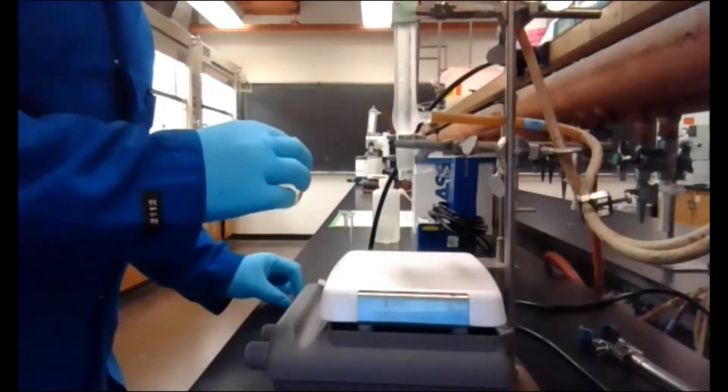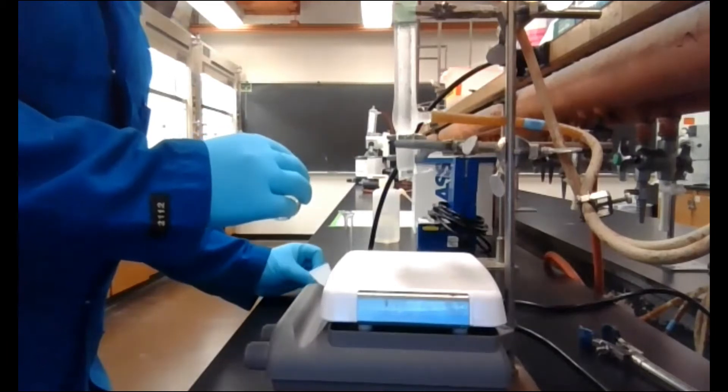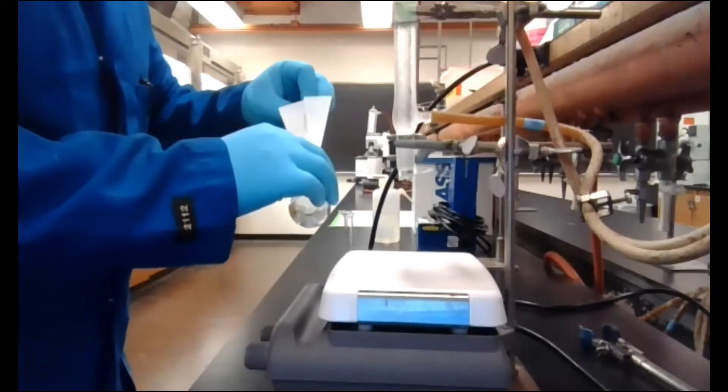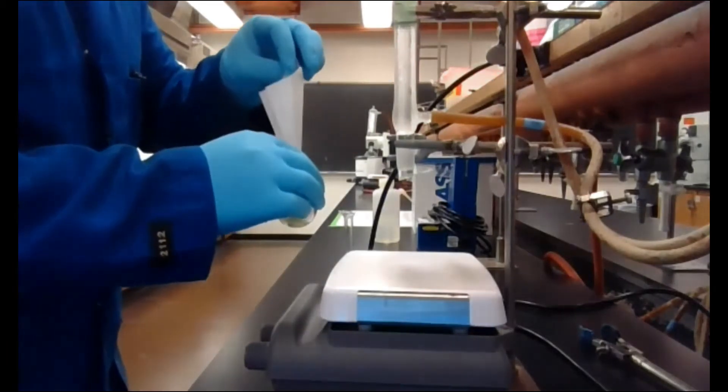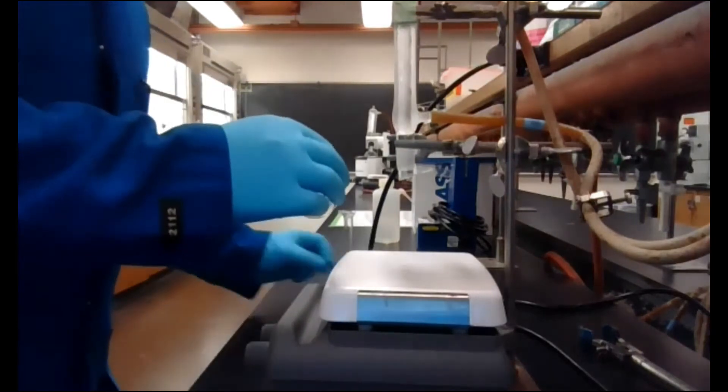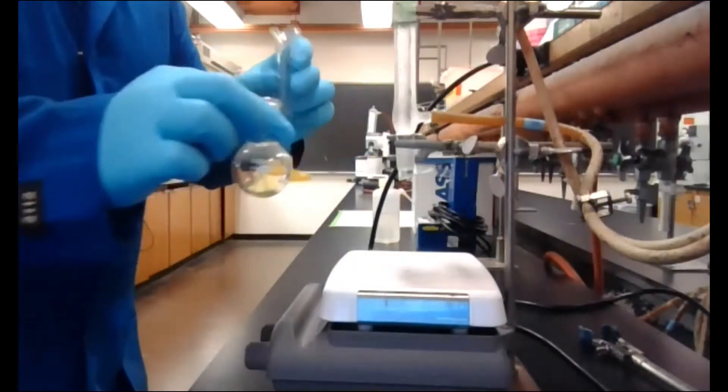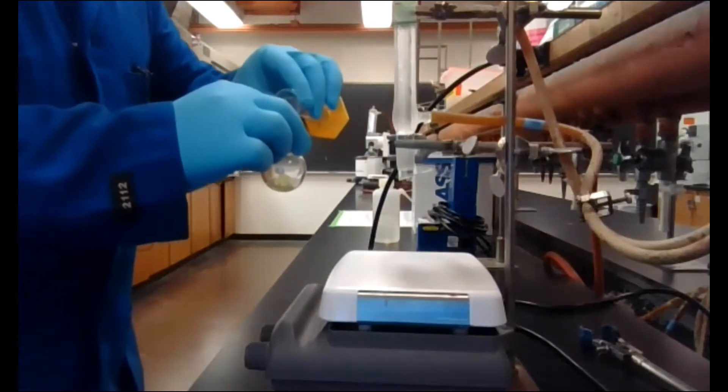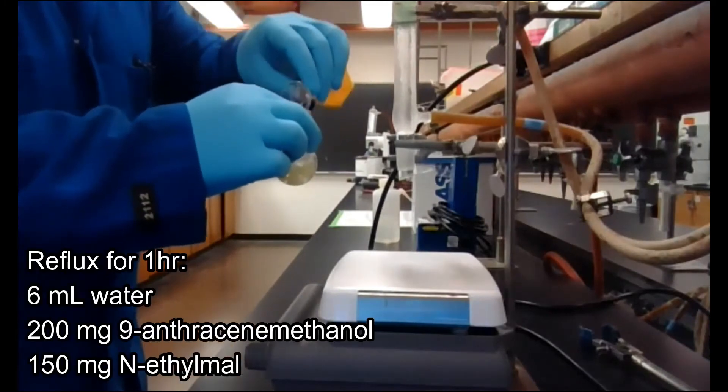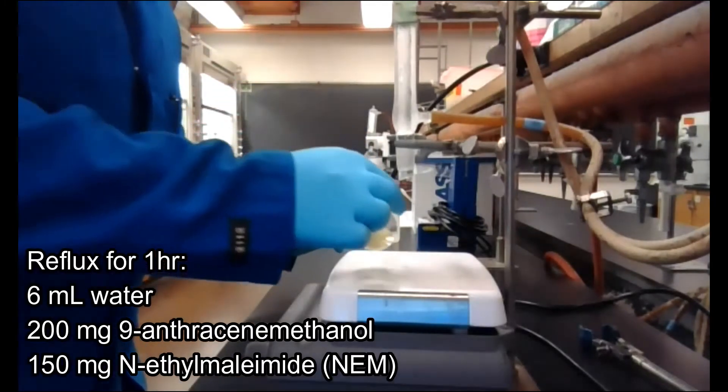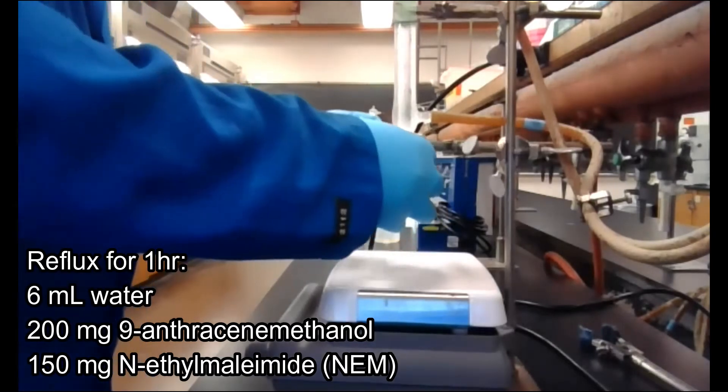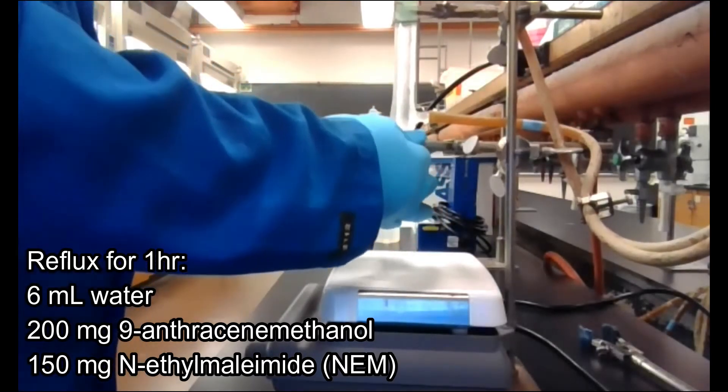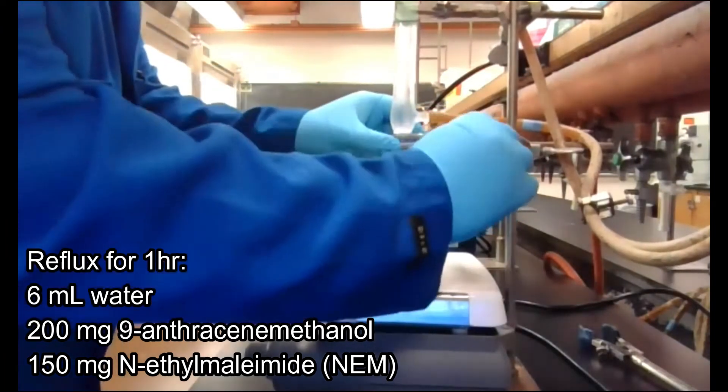To this, I'm going to go ahead and add 200 milligrams of the 9-anthracene methanol, and six mils of water, and we're going to hook this up to our reflux condenser, clasp it in with that clip.